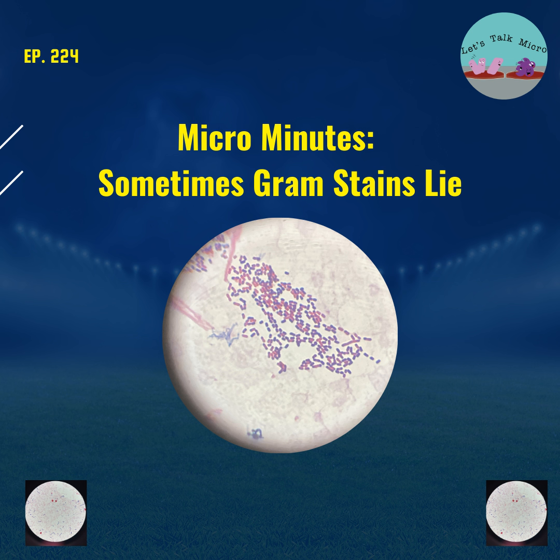So when you see that, at least you know to ask someone, maybe repeat the stain and take a second look. The same goes with rods, right? Think about gram-positive rods. You have things like boxy, like Bacillus. You have long and thin, like Lactobacillus. You have coryneform, like Corynebacterium. So if you see something that's staining negative, but it has that morphology or arrangement typical of those gram-positive rods that I mentioned, that's worth a second look.